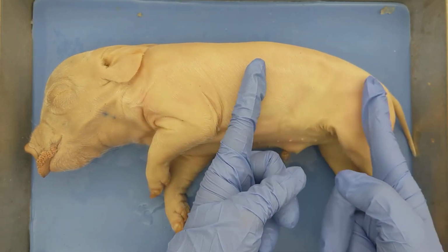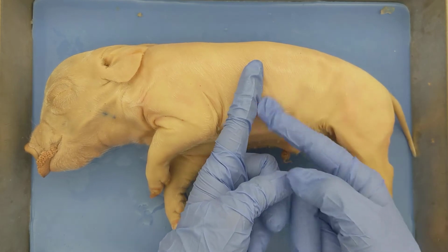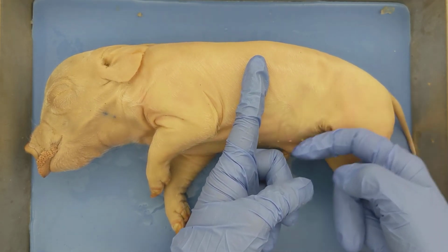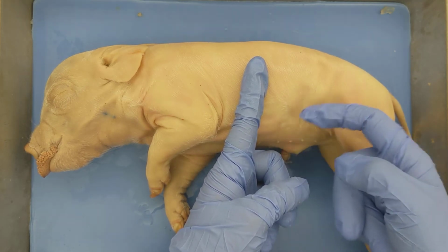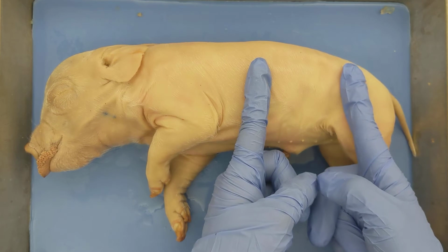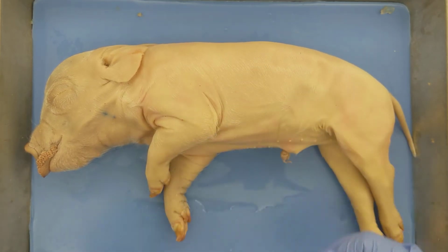So the abdomen region is kind of this part here on the pig, all the internal organs in this region up until the hips, right? So you'll find a lot of the reproductive organs in the abdominal region, things like the kidney and the bladder also located in the abdominal region, right?